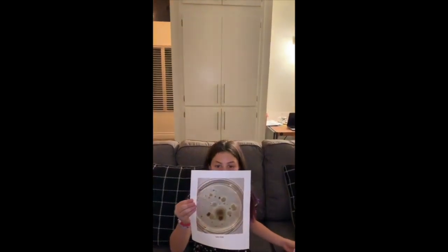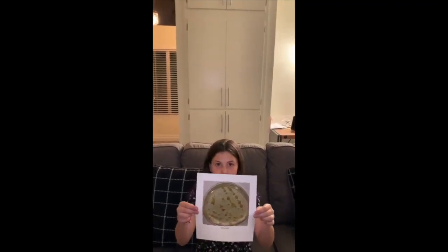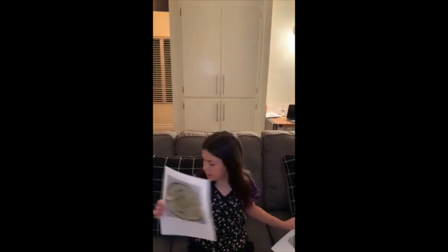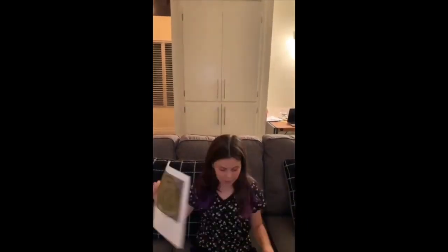My hand at day 5. And this is my dog's mouth at day 5. Dog's mouth at day 10. And here's my hand at day 10. This is my dog's mouth at day 15. And this is my hand at day 15. As you can see, my hand had more bacteria than my dog's mouth.